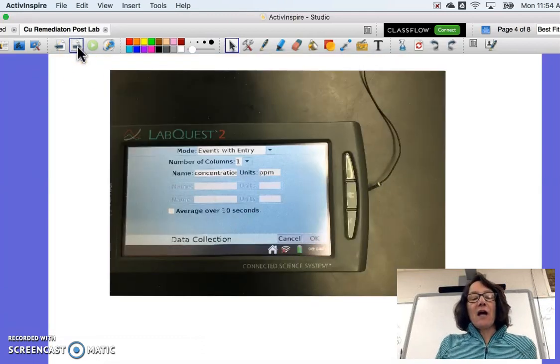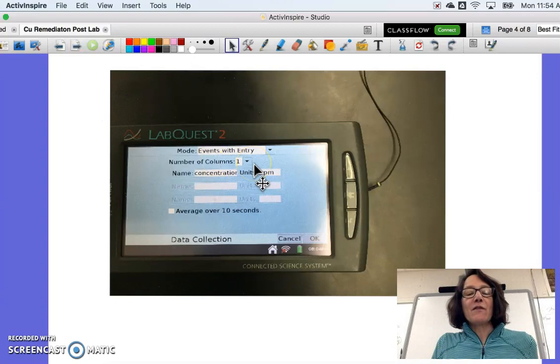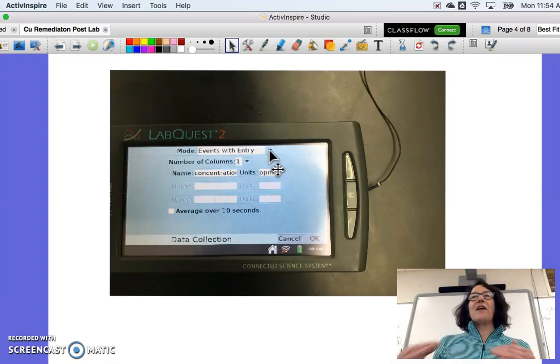So to set up the LabQuest for the first part of the lab, we're doing an events with entry. This is all clearly spelled out in your pre-lab, meaning that I'm not collecting data and then just stopping. I'm not collecting data over time, which is a traditional method that we use. We have 7 different test tubes that we want to determine the absorbance of based on the concentration. So my event that I'm doing is concentration.